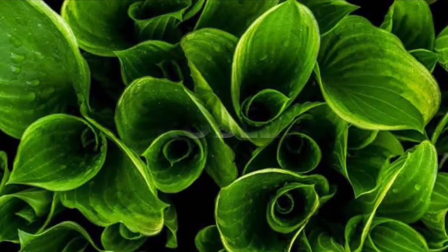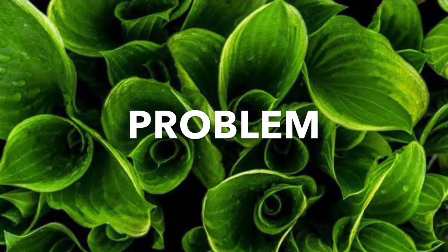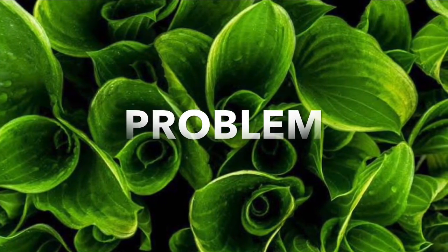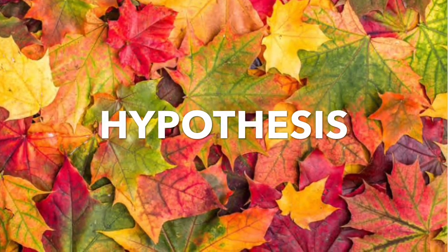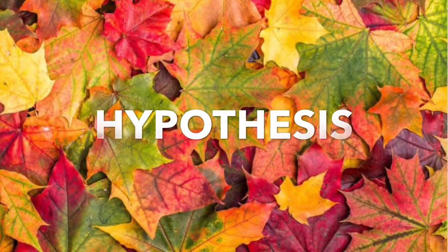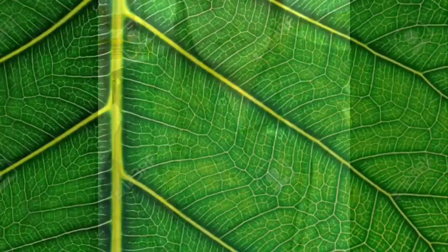The chromatography process for each one of the different plants will help us to take out the pigments of them. The problem of our experiment was: how can we separate the different pigments of the leaves? If we use a chromatography process, then we can separate the pigments of the plants because of the molecular weight of different pigments.